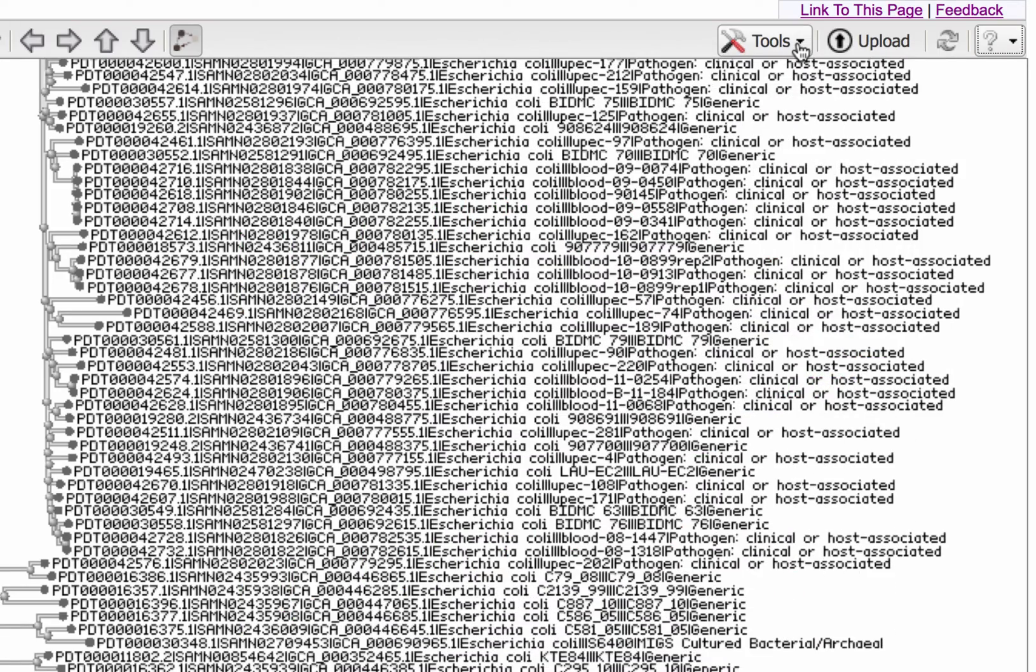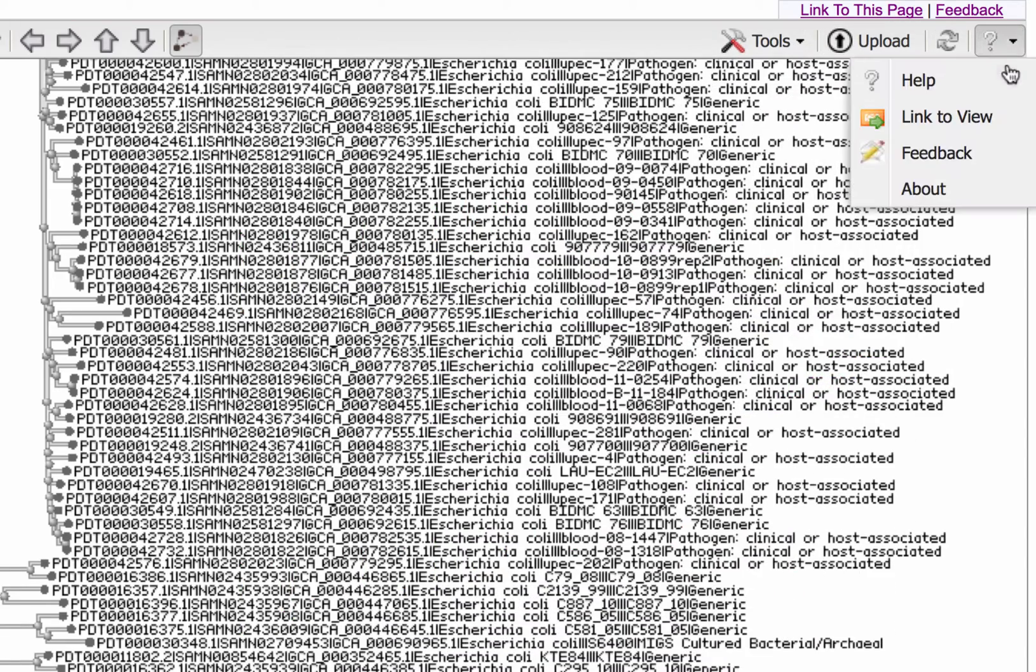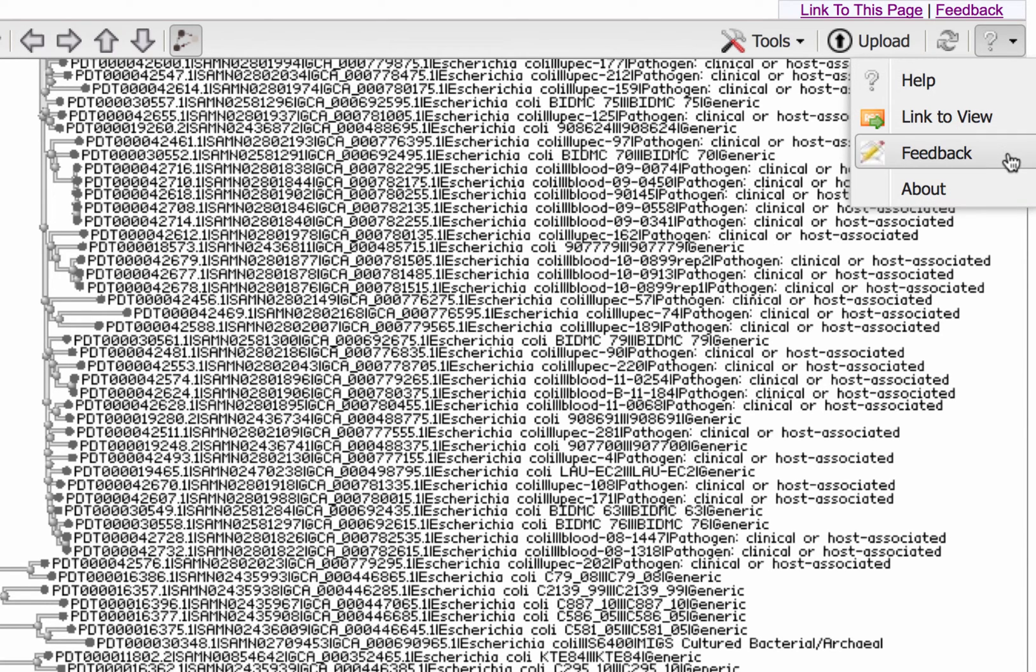That's it for this demonstration. You can find help here in this menu in the upper right, as well as a link to provide feedback. And with Link to View, you can generate a short URL to share the current view with a colleague.